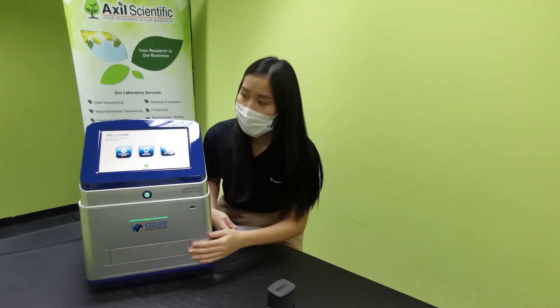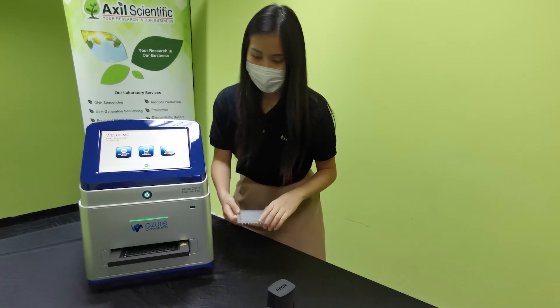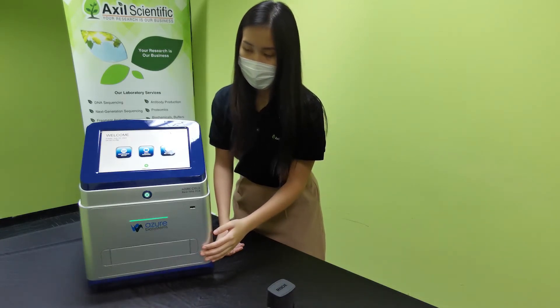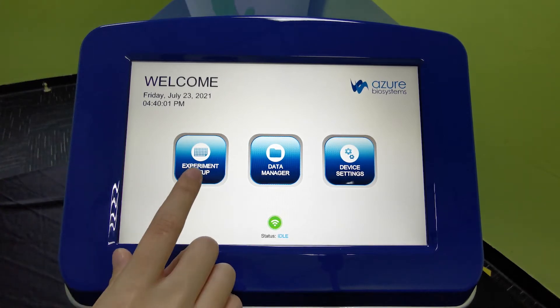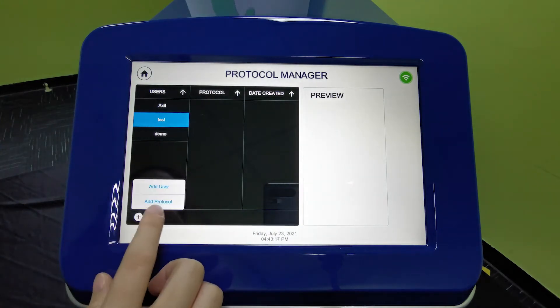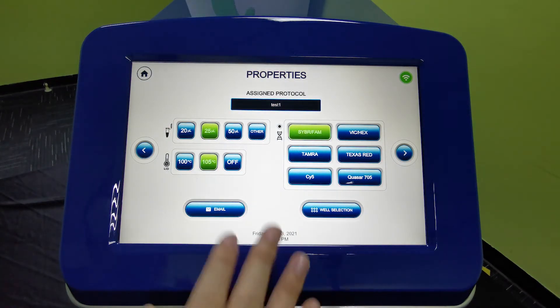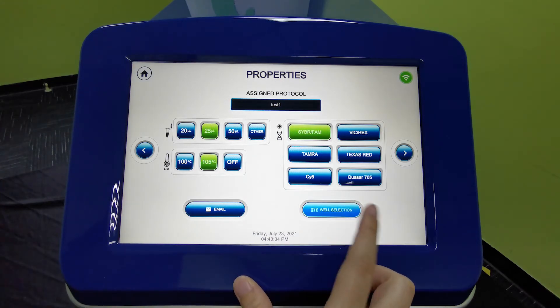You will see there are two buttons here — either is fine. Once it shows green, you are ready to start using the system. We can load the plate and input our well. Let's head on to experiment setup, where you can set up new runs and new users. For labs with multiple users per system, you can add a user — we'll call it 'test'. Under that user, you can set up new protocols — we'll call it 'test one' — and it will bring you to the setup page.